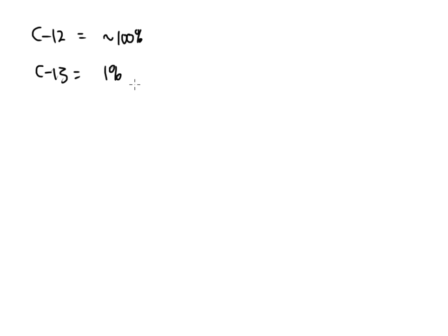So every now and then, we're going to get a molecular peak plus 1. If the molecule weighs 72, we could get the presence of a fat carbon, an isotope, and that will give me a 73 on the spectrum.